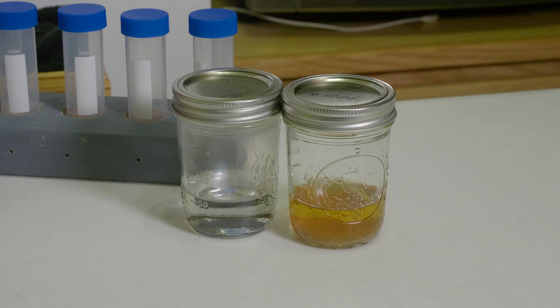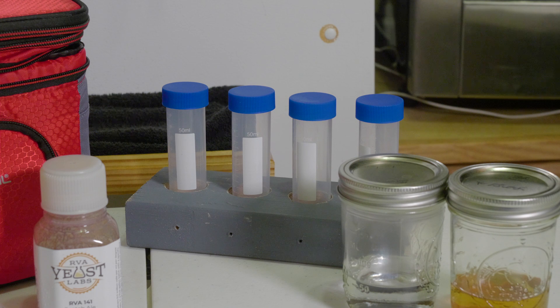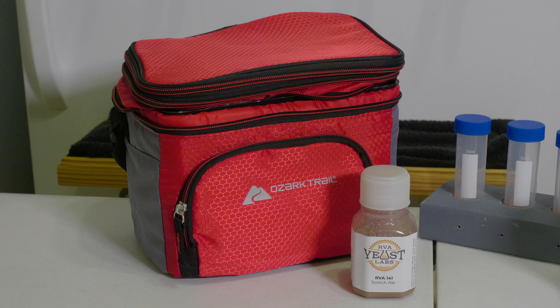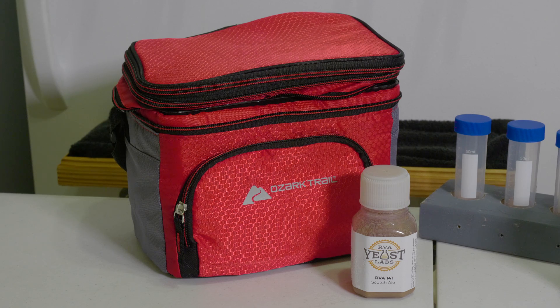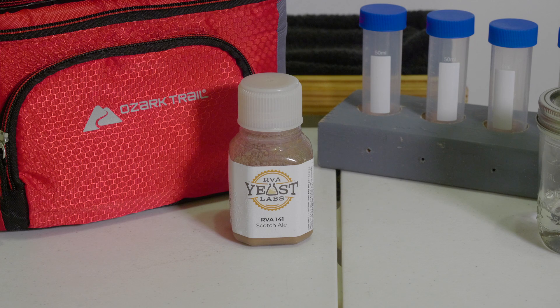We have 1020 wort as well as glycerin. I pressure can this up so it's sterile before I use it. We have 50 milliliter vials, which I got on Amazon. Then we have some sort of cooler you're going to put in your freezer. Pretty much anything will do. And then we have the yeast. I like to use RVA yeast from RVA yeast labs.